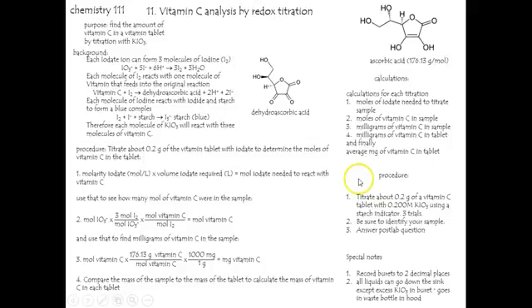The procedure is very straightforward, and perhaps it'll be brief, we'll see. I have a feeling that things are short enough that if you run into a problem with a titration, it didn't go well, simply abandon it and get 3 good trials. So you'll take 0.2 grams of vitamin C tablet, you'll grind it up in a mortar and pestle. If it's written as an unknown, I don't know if all the samples are identical, so make sure that you identify the sample that you used.